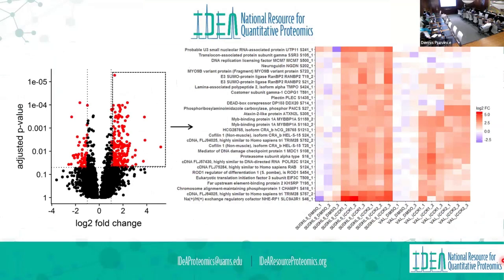This is a screenshot from a previous version of ProteoDA. And actually, I was going to ask Stephanie, I forgot this morning. I haven't looked at phospho data in ProteoDA in a while. Are these features still there? No, that's okay. What's broken? Okay, the software package to do that isn't updated anymore. Gotcha. Coming soon. Yes, exactly. That's version two. Coming sometime.